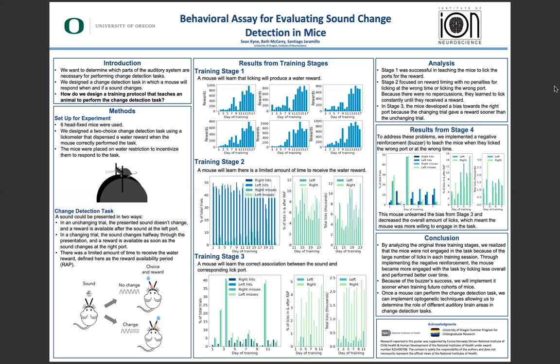In graph two, I found that they were barely licking during the RAP, while graph three revealed that they were licking quite a lot despite missing many of the trials. After training the mice on stage three, it became clear that the mice had not learned the change detection task as we had planned.